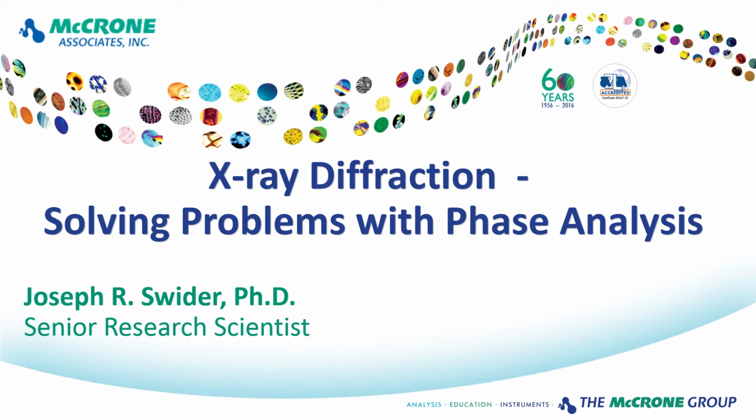Today, I'm going to talk about how McCrone uses X-ray diffraction to solve many materials analysis problems. I'm going to go through a small amount of background for X-ray diffraction, show you what kind of instrumentation and capabilities we have at McCrone Associates, and then illustrate that instrumentation with some case studies. So we can start out with the basics.